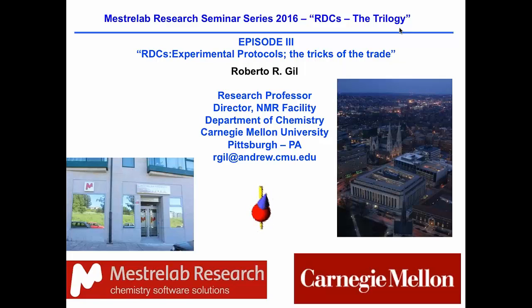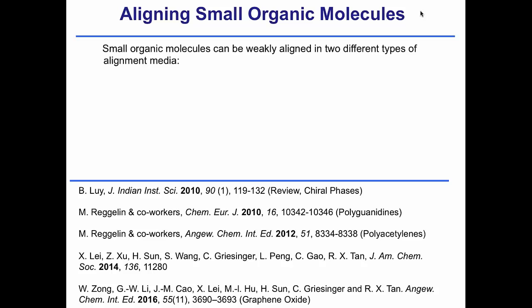Well, the webinar today is going to be quite informal. It's not like a formal presentation. My goal here is to share with you the experience, and what I want to show you particularly is how to prepare the sample and measure the gels, and probably measure also RDCs, but mainly the experimental part, especially sample preparation. So let's go.